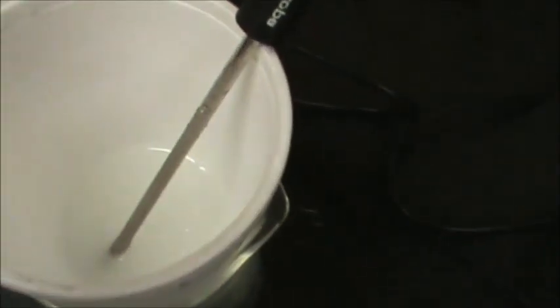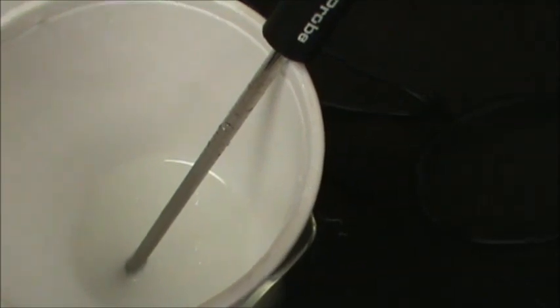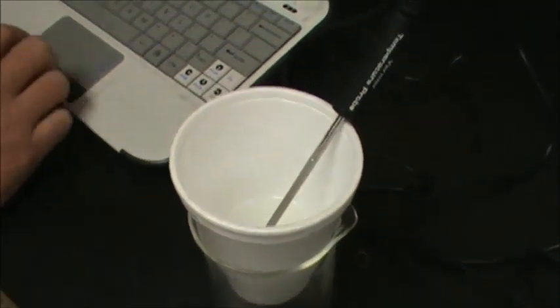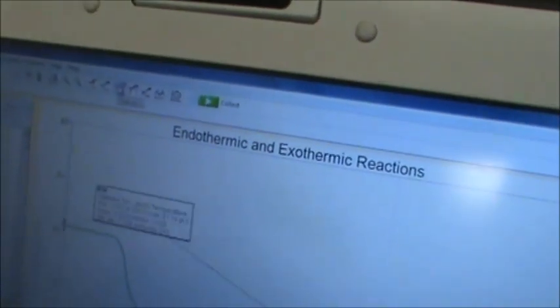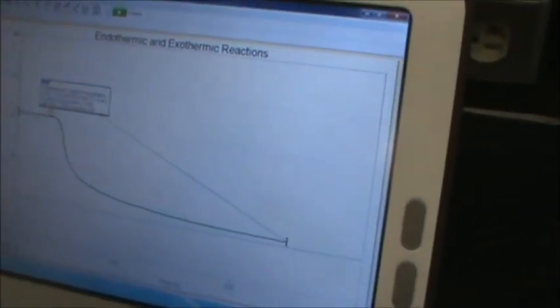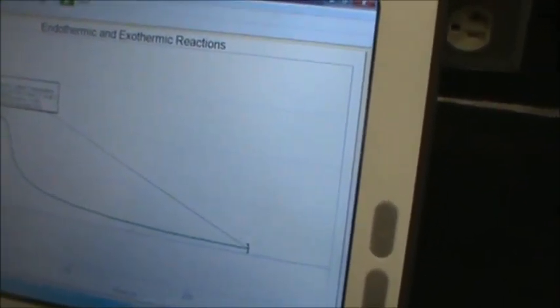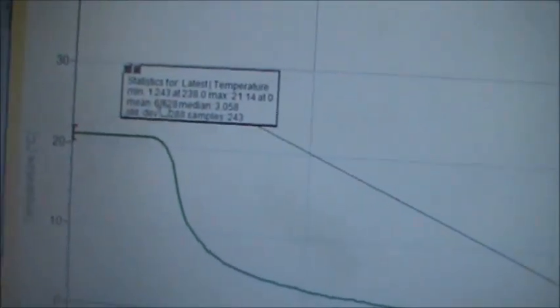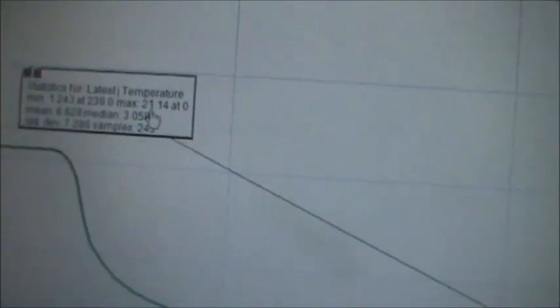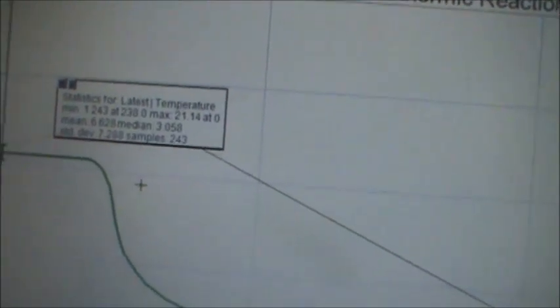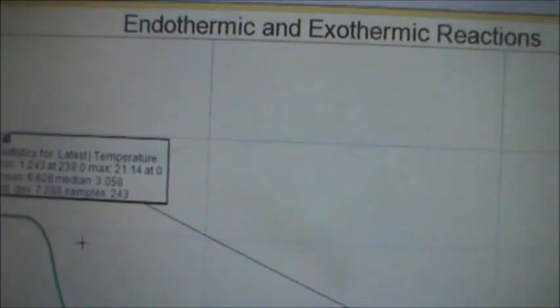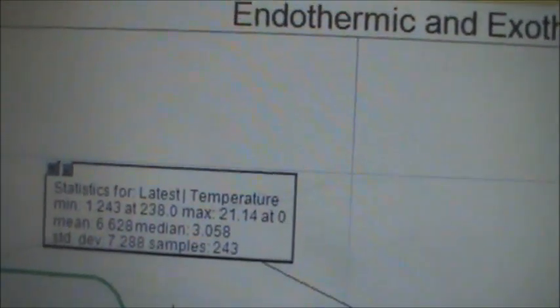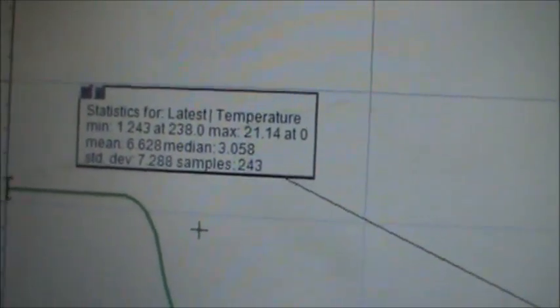Now that the first reaction is done, we make our final observations — the fizzing has calmed down to barely anything. We follow step eight and dispose of the chemical reaction by dumping it down the drain. In step nine, we click on the Statistics button at the top. A dialog box comes up showing important information: minimum temperature, maximum temperature, mean, median, and standard deviation. Our initial temperature was about 21.14 degrees Celsius and our final temperature was about 1.24 degrees Celsius.